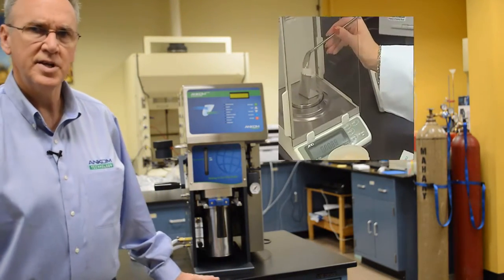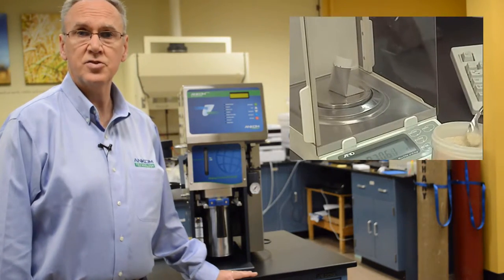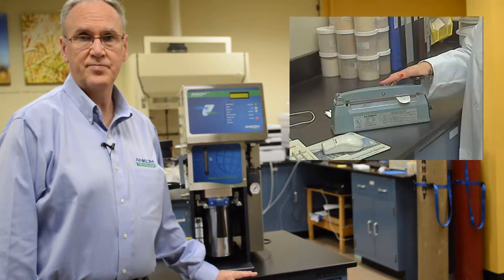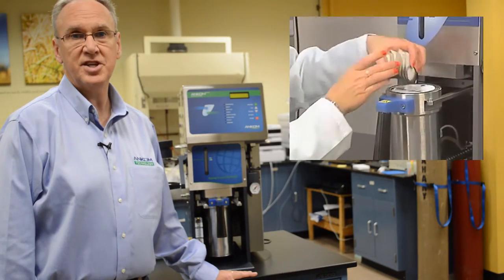The system is easy to use. The technician simply weighs a sample into a filter bag and seals the filter bag to encapsulate the sample. The samples are then pre-dried, re-weighed, and then placed in the XT15 Extractor.